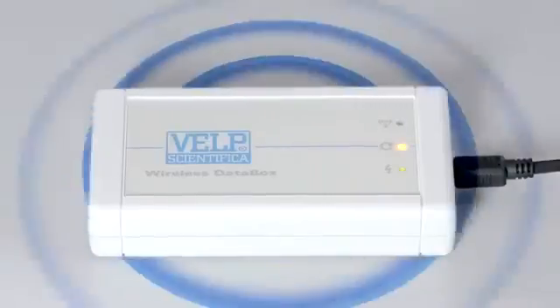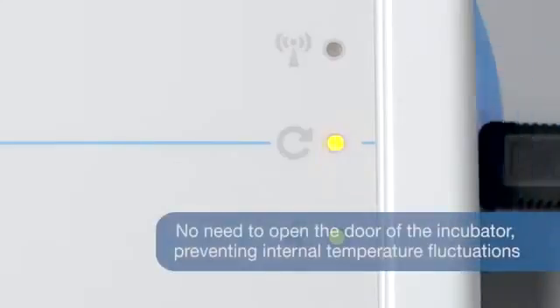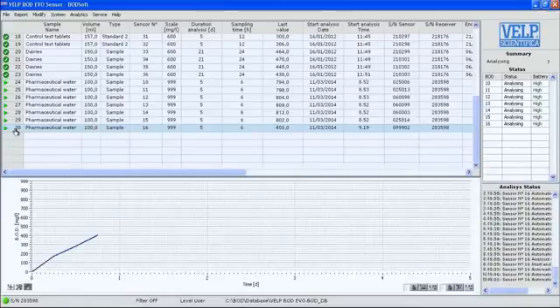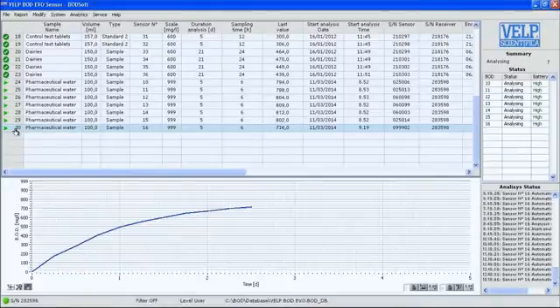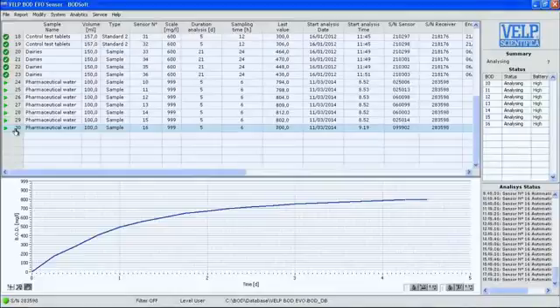BOD EVO sensor ensures outstanding reliability as there is no need to open the door of the incubator for data monitoring. There is no risk of internal temperature variation during the test. Forget about the analysis, results will be sent automatically to the wireless data box.